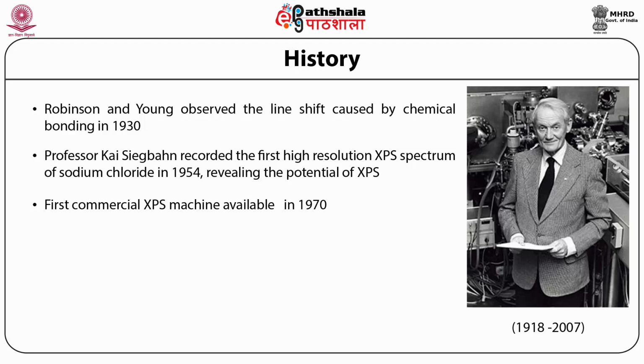Due to all these chemical effects, the Swedish group gave the term electron spectroscopy for chemical analysis, which in short is abbreviated as ESCA. For the development of the XPS technique, Professor Kai Siegbahn was awarded the Nobel Prize in Physics in 1981 for his discovery.